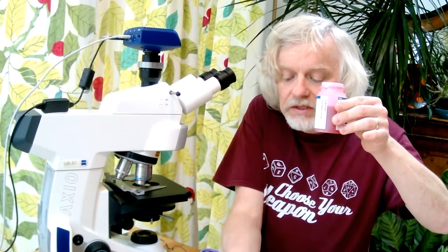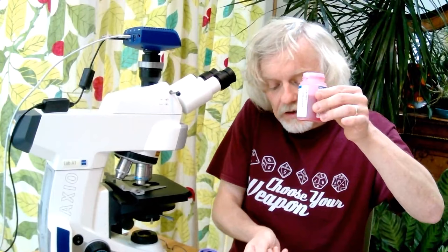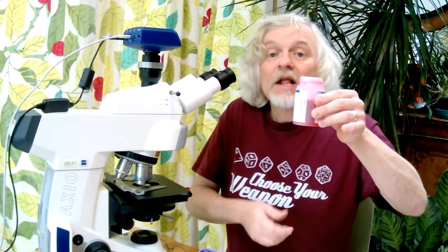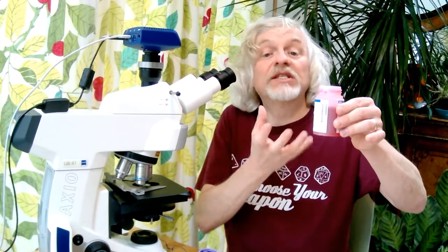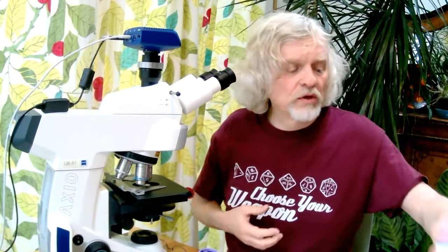I'm just keeping an eye on my slide. I think we've dried already. Is that dry? Yep, that's dry. This one will stain the inside of the cell. It's the stuff called the cytoplasm, okay? So it's just all the goo that's on the inside.